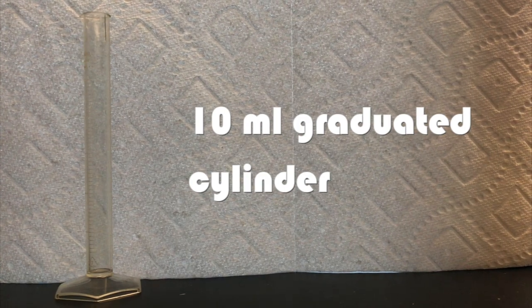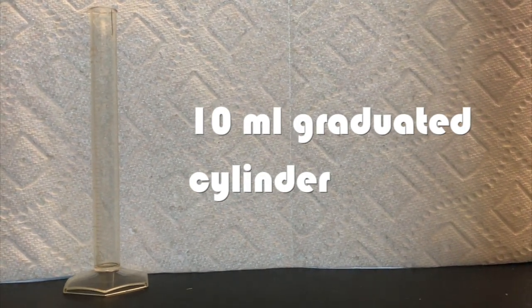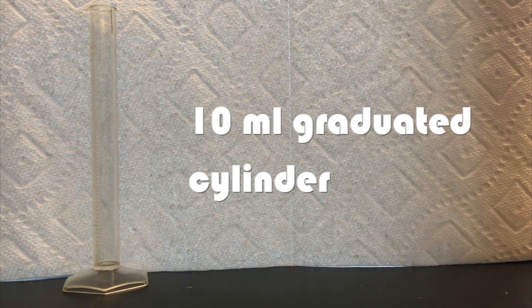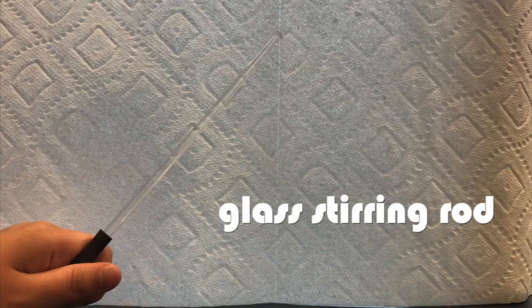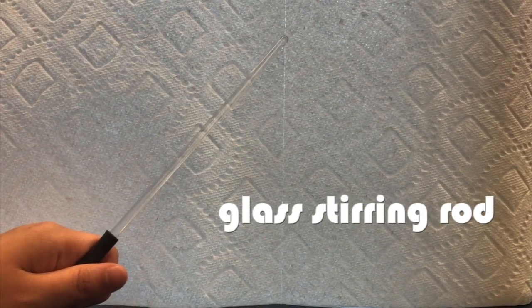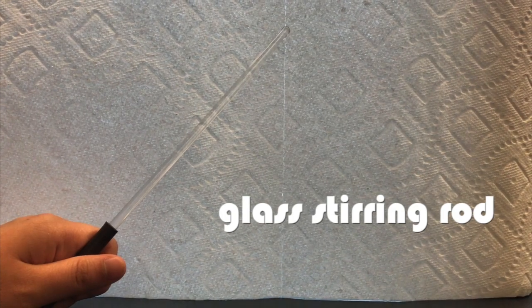This is a graduated cylinder. It is used for measuring precisely a volume of liquid to be poured all at once, rather than dripped from a burette. This is a glass stirring rod. It is used for stirring liquids. Additionally, it can be used to transfer liquids from one container to the other.